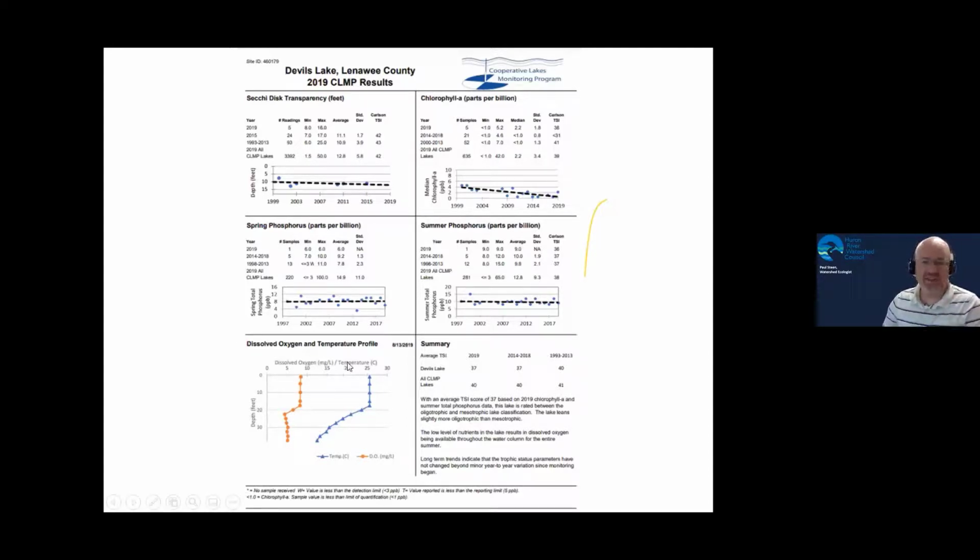The dissolved oxygen is a little different because I can't show an entire series worth of information for dissolved oxygen. What we see here is a particular day of someone sampling. It's one profile. What I will often do for dissolved oxygen is look at all the profiles that you've created over the course of that year and pick the one that shows the point at which the stratification happens for your lake, where you have this break where the dissolved oxygen is there, and then suddenly it disappears. Most lakes have some point in the summer where that happens, especially if you're a mesotrophic or eutrophic lake.